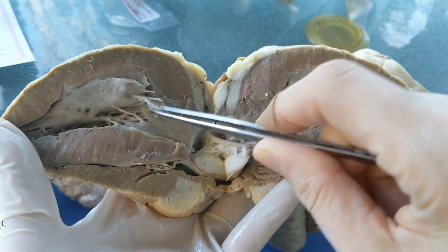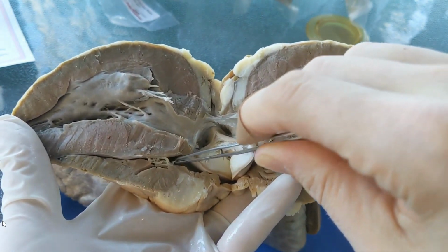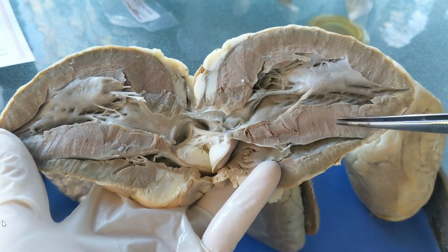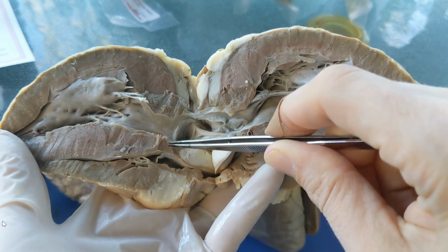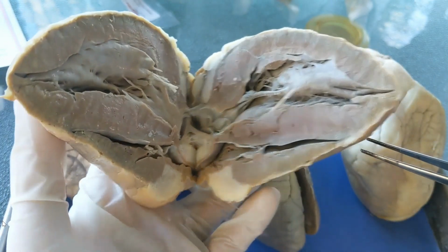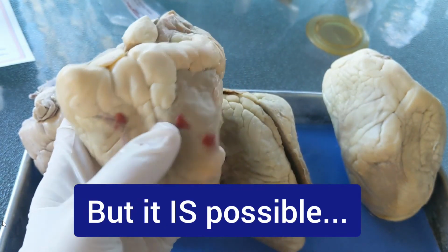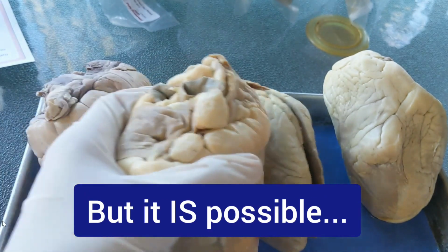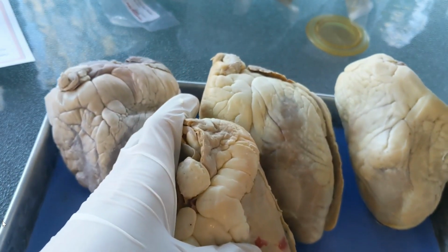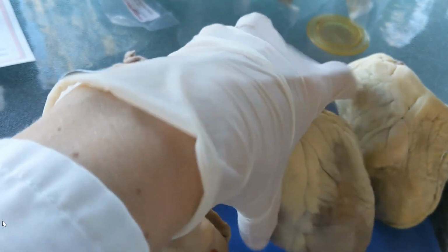You also want to check the valves. Make sure the valves look intact. These valves are gorgeous. And look at the septum between the ventricles. Look at the septum between the atria. See if you notice any problems with the septum. It's unlikely they're going to have more than one problem. So if you already noticed a problem externally, then they're probably not also going to have a problem internally. So that was B. That was our 57-year-old taxi driver who was found dead in his car.